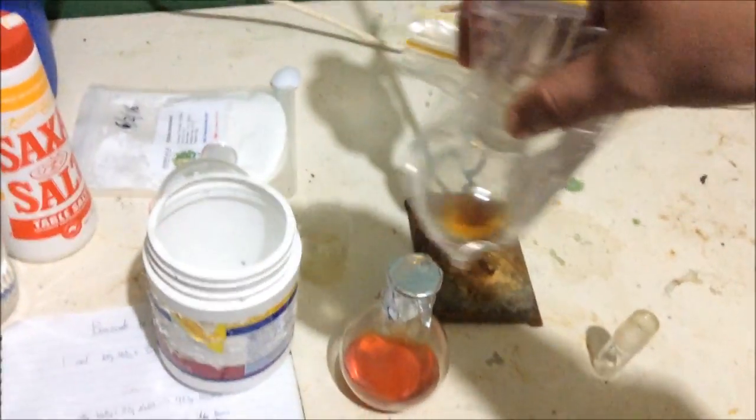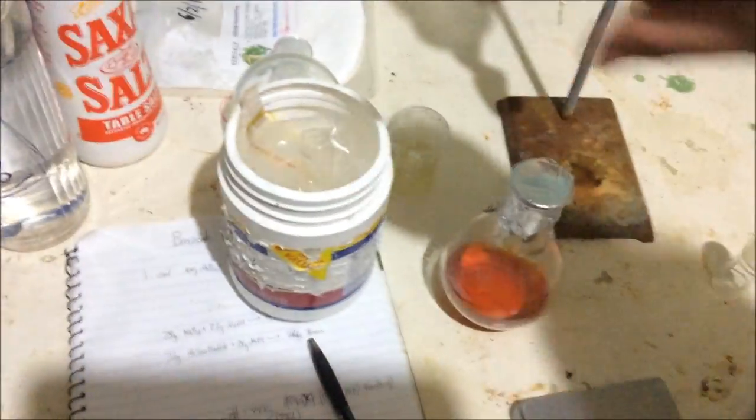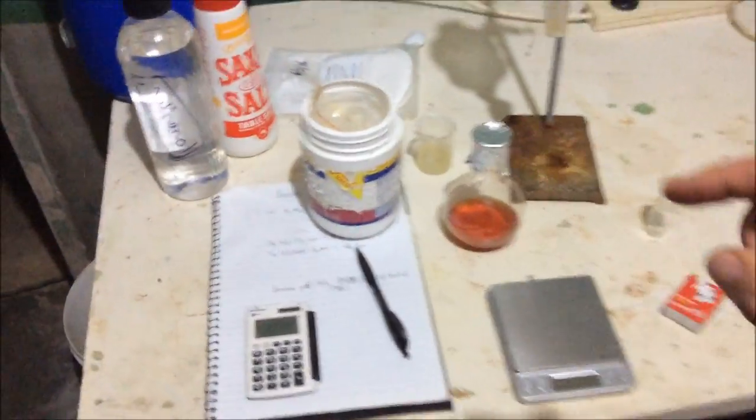I've got my benzene from the dry distillation of sodium terephthalate, and there's not much compared to the benzoate amount. So we're going to combine the two benzenes together and dry it over calcium chloride just to absorb any last remaining water. Then we'll put it in a distillation flask, distill it, and we should get nice clear water-free benzene.